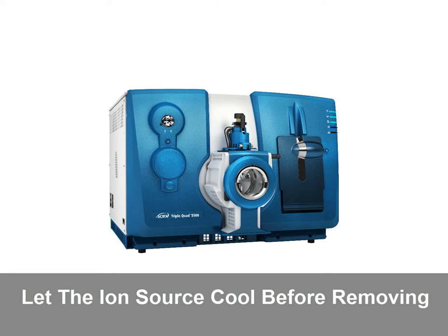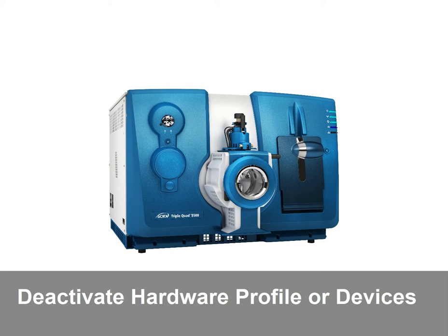Let the ion source cool and make sure it is cool to the touch before removing. Deactivate the hardware profile or devices.